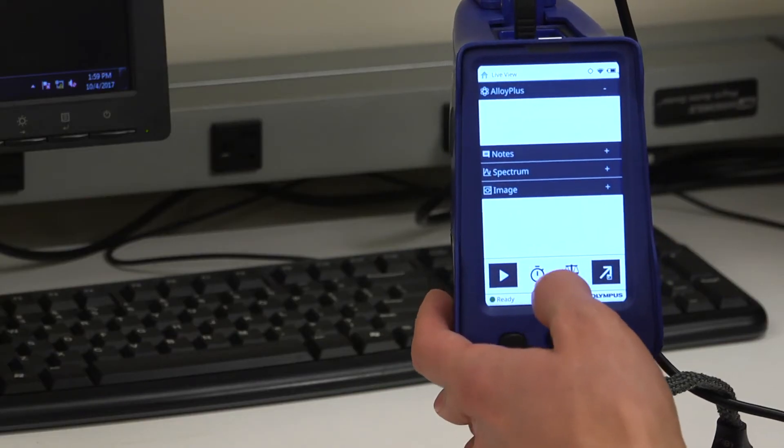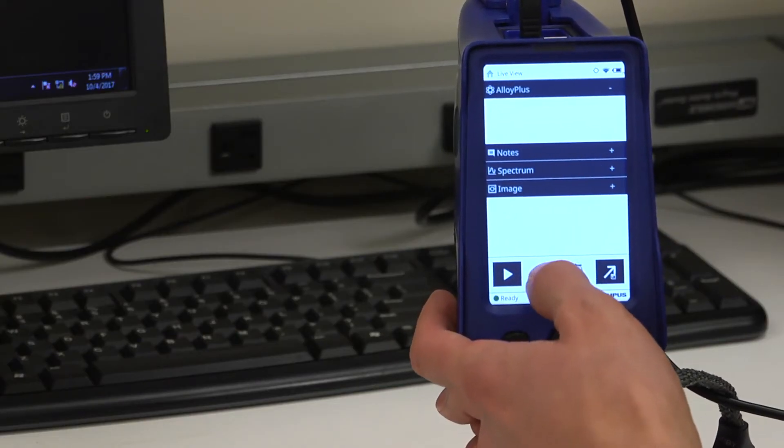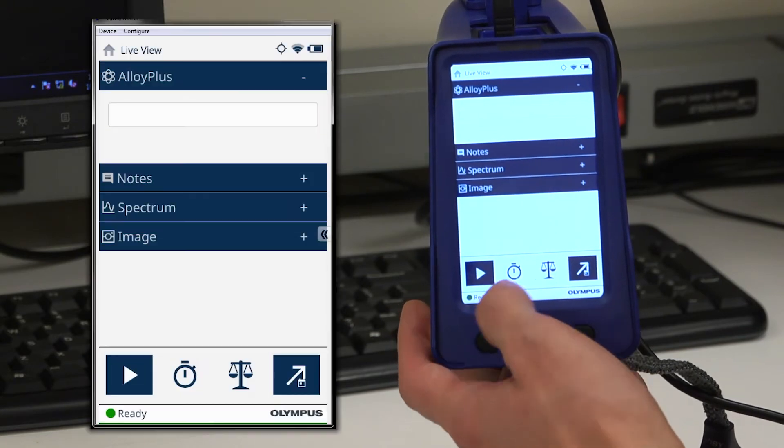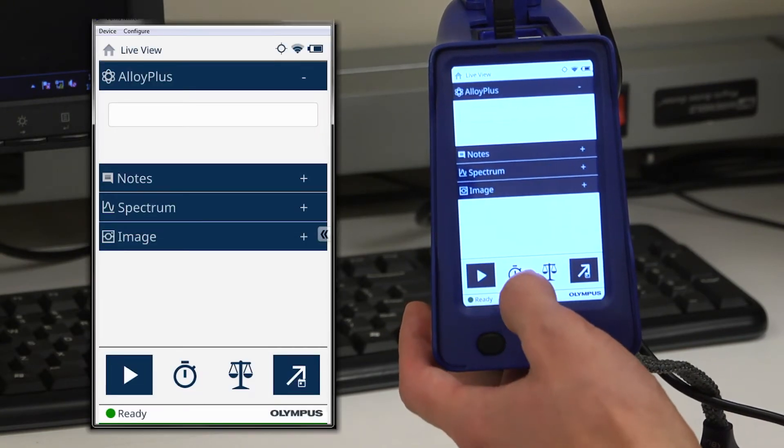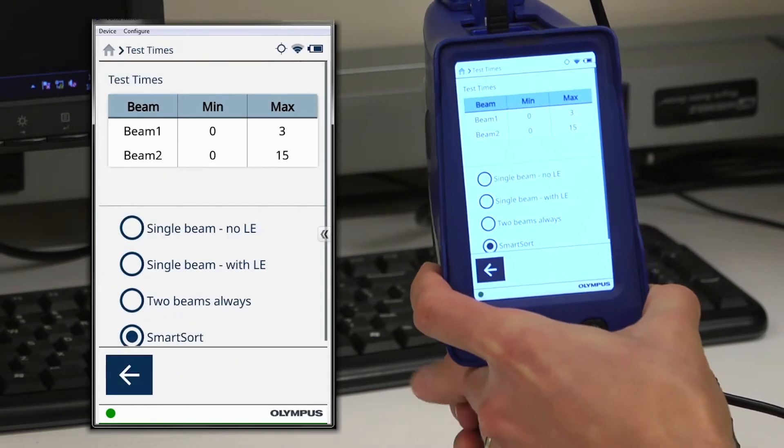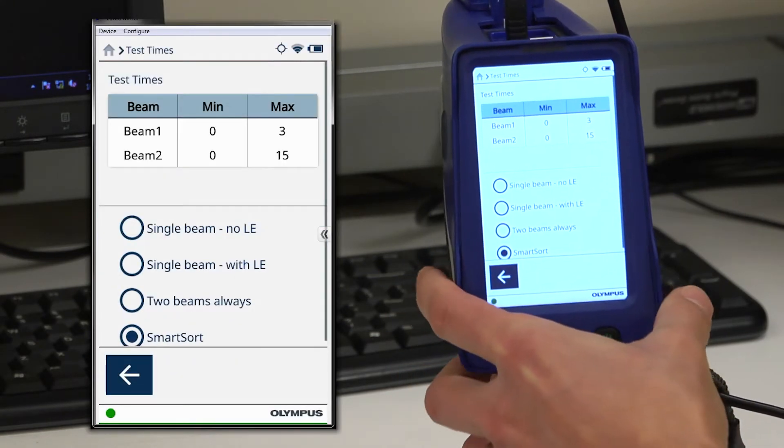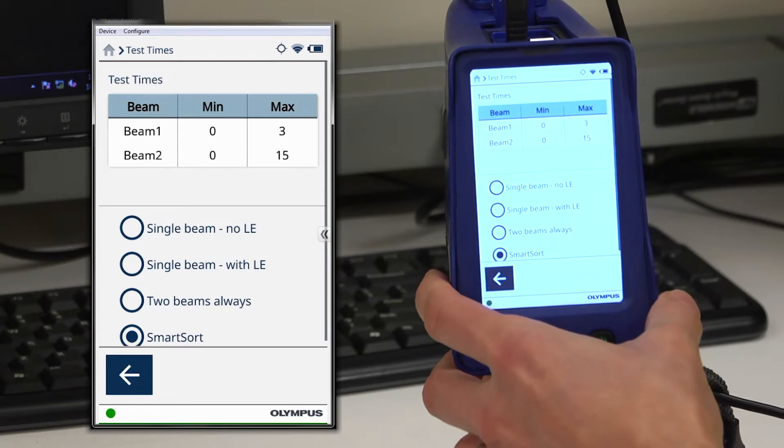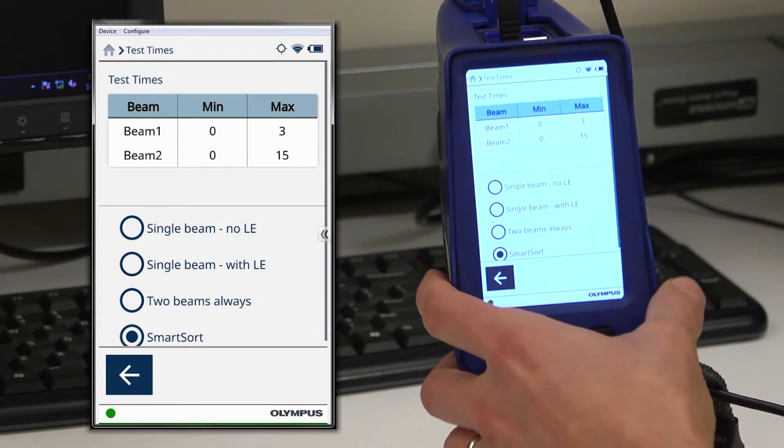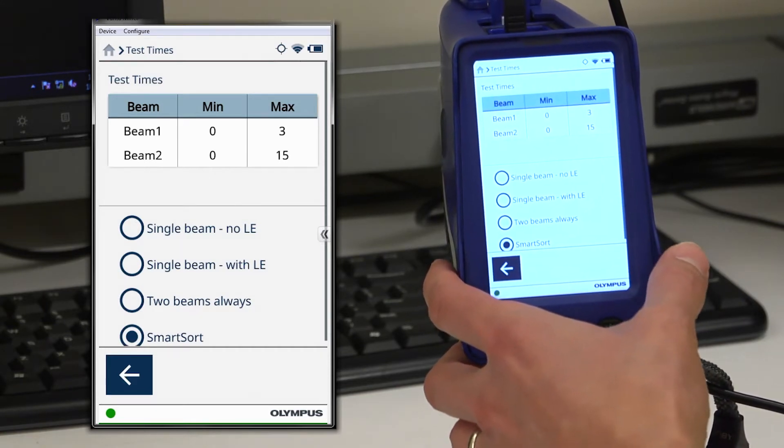In order to access the test time settings screen, at the bottom of your results screen there is a clock icon. Clicking the clock icon brings you to the test time settings. You can see a wide variety of information here.